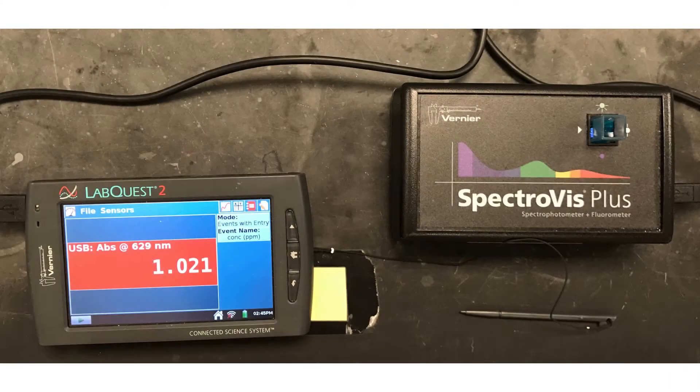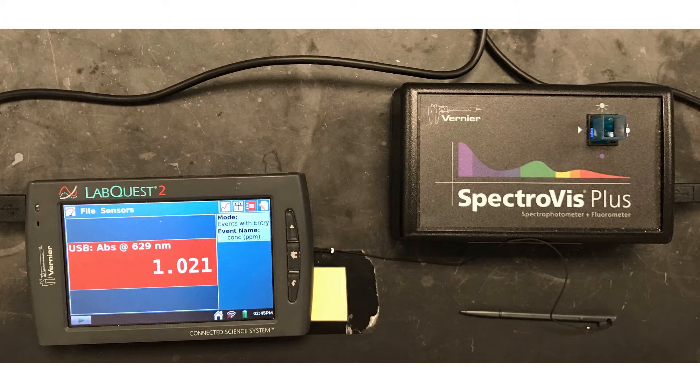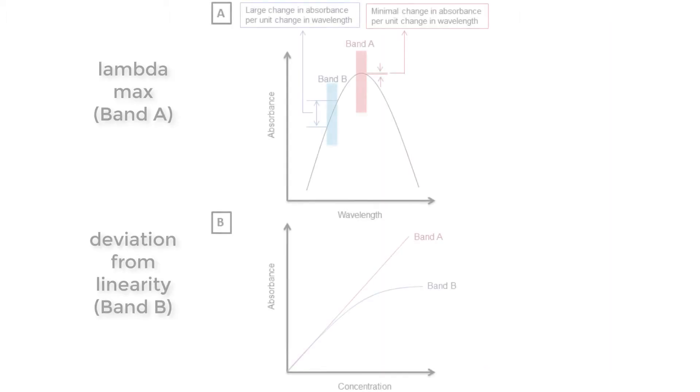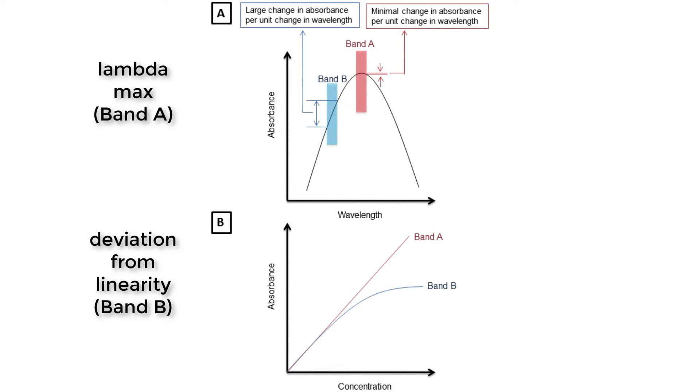If we choose the darkest sample, you'll see that the sample is giving an absorbance of 1.021 at 629 nm. This absorbance is outside of the linear range. The instrument chose 629 nm as the wavelength of maximal absorption. It is here that we see a minimal change in absorbance per unit change in wavelength. Thus, when we monitor absorbance as a function of concentration, we see a linear relationship.